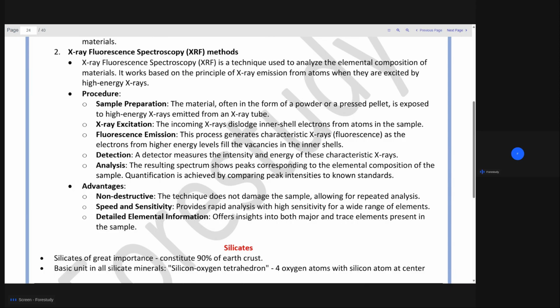Then soil analysis can be done using XRD and XRF. Weathering products like goethite and hematite are not observed in optical mineralogy because they are very fine grained and messy in structure. So soil analysis, matrix analysis, cement analysis, or goethite and hematite, these are all weathered products, and they are very much used in remote sensing as well as in engineering geology.